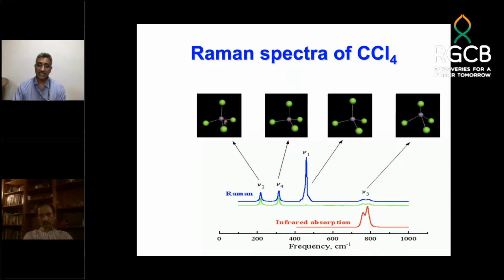You can see here it is like a scissor motion. This is compressing, this is compressing, this is expanding, this is expanding. So it is perpendicular. Any tetrahedral molecule can be considered as two V's perpendicular to each other. And it is not only this. If I had CH4, then also the spectra would look the same. SO4, which is also a tetrahedral molecule, would look the same. So in fact, the spectra will look the same irrespective of which molecule it is, but the value of this would be determining whether it is CH4 or CCl4 or SO4.